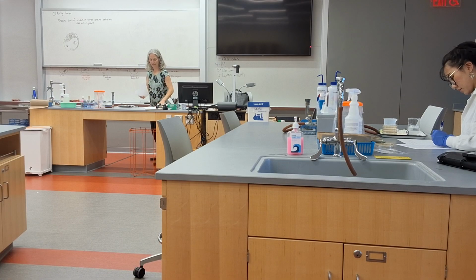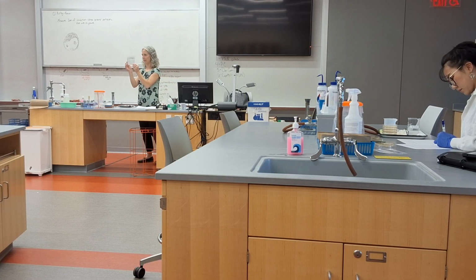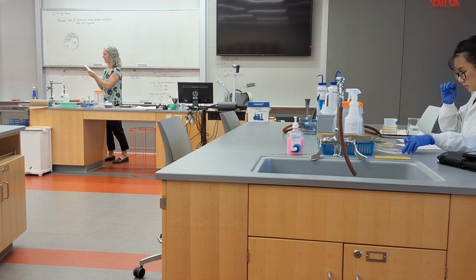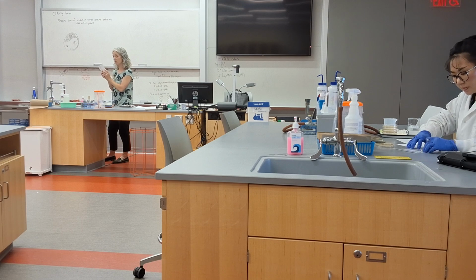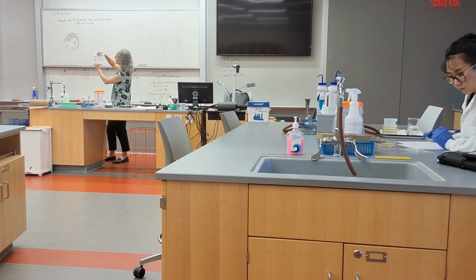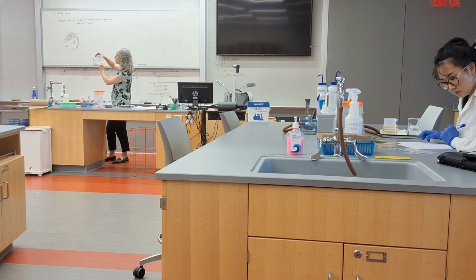Once you have that information, you're then going to look at this card. So if you determined for penicillin, let's say, that your zone of inhibition was 15 millimeters, well, you look under penicillin and you see, greater than or equal to 15 means that that microbe is moderately susceptible to penicillin.